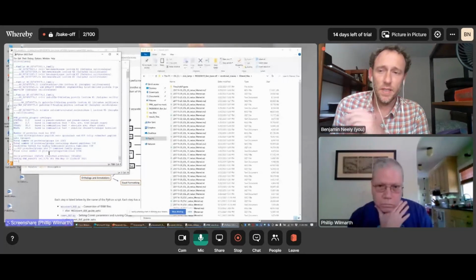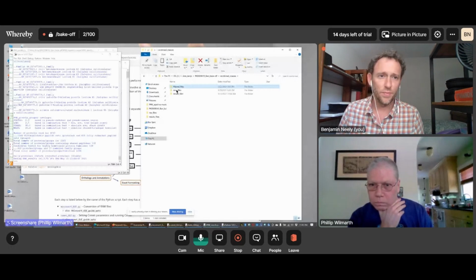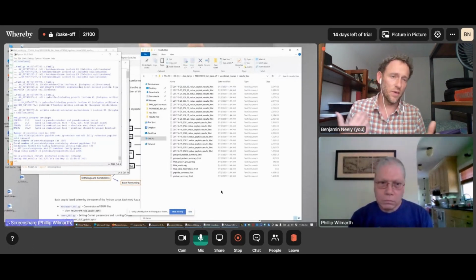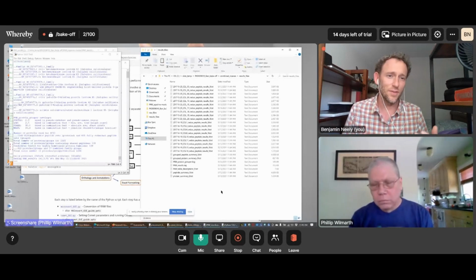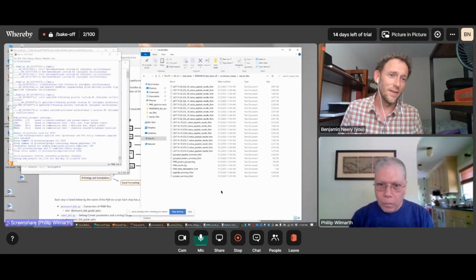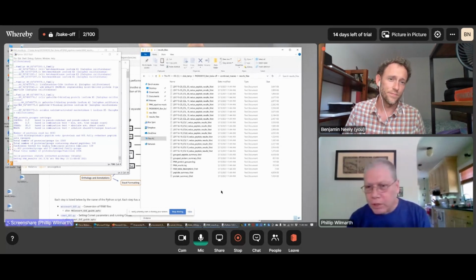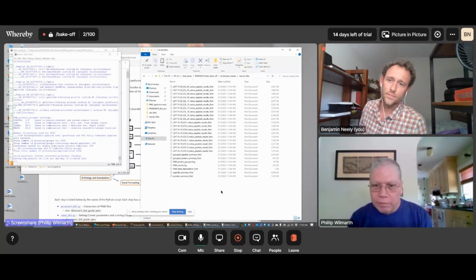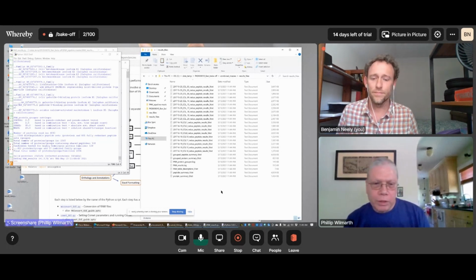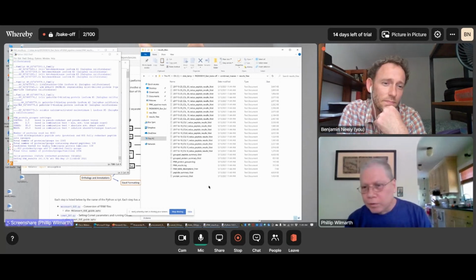And in this case specifically, for whoever is looking at this in the future, your GitHub write-up on this data set and this analysis goes into that pretty well. In addition to this audio discussion, there's actually a pretty verbose discussion. Right. So we've got a full analysis of this data set, and we've also got descriptions of all of the pipeline steps with the different yeast data set from the Gaiji lab. Yeah. So everything's pretty thoroughly described, and different data sets pretty much look the same when you run them through. So any of these examples are going to give you a pretty good idea how to do the analyses.